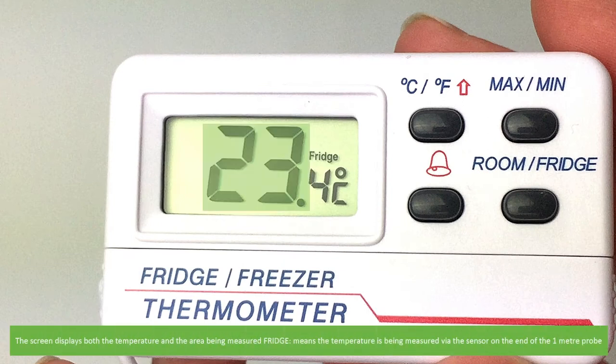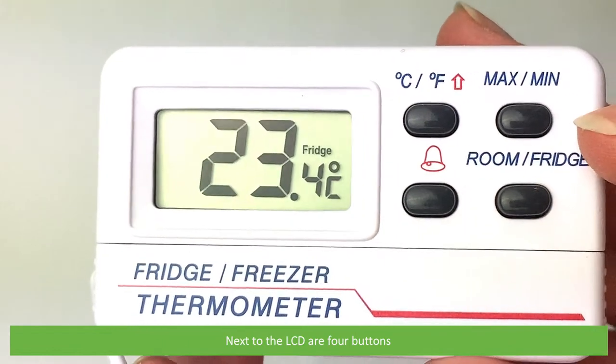The screen displays both the temperature and the area being measured. Fridge means the temperature is being measured via the sensor on the end of the one meter probe. Next to the LCD are four buttons.